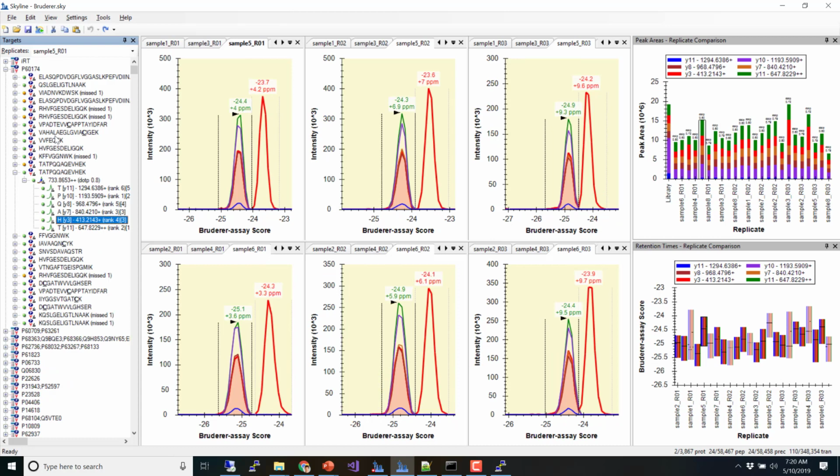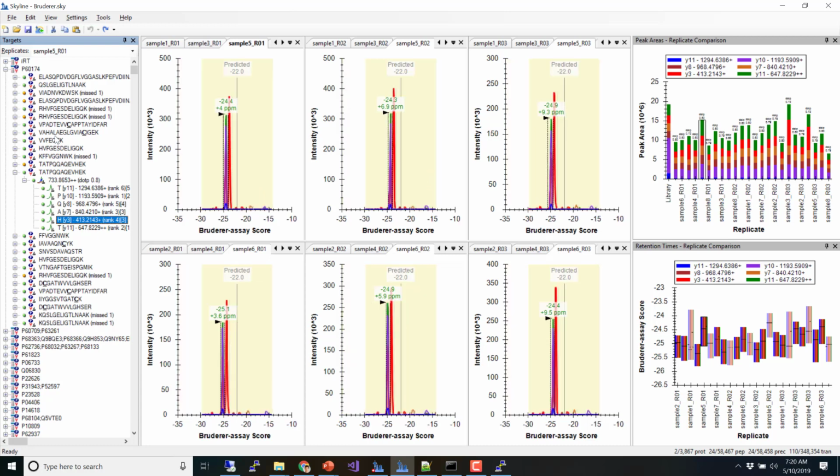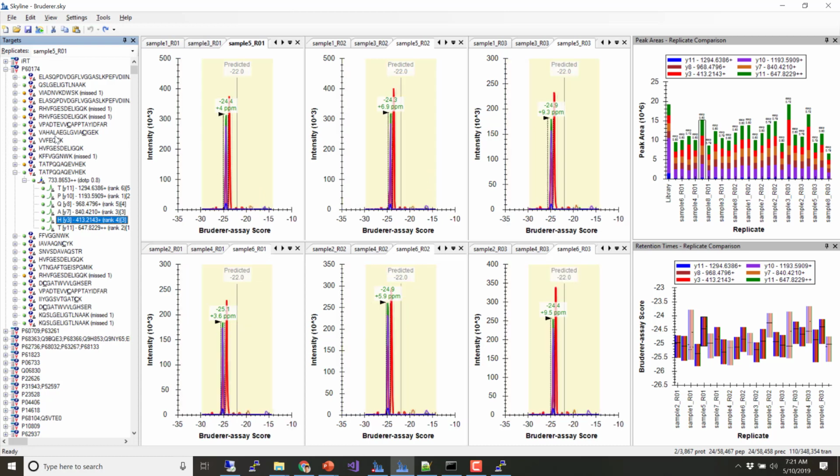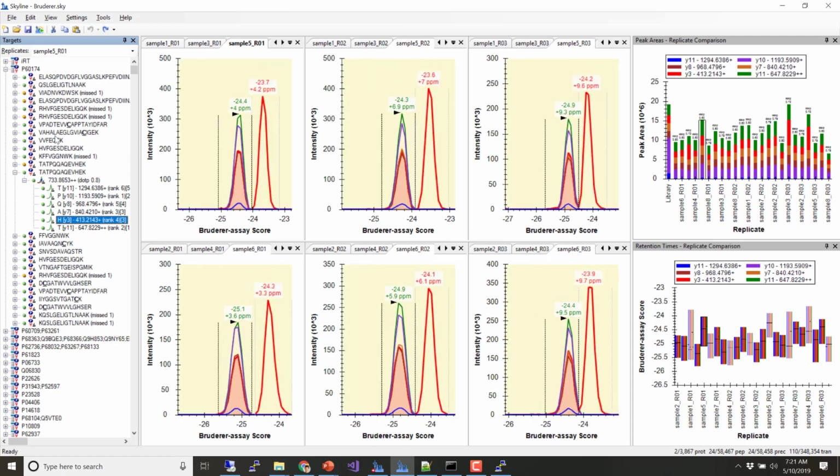I talk about the chromatographic landscape. Is there anything but those two things? Not really. Okay. So this is part of the chromatographic landscape. And actually, if we were looking at MS1s and I did this Shift F11, I guarantee you there'd be more to look at. So these data, despite not being as good as PRM or SRM, they are less.